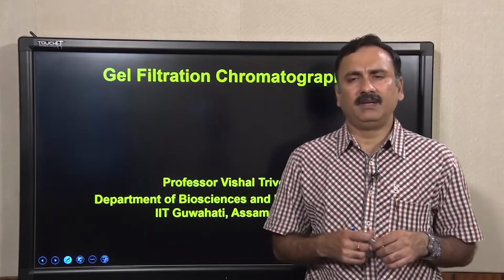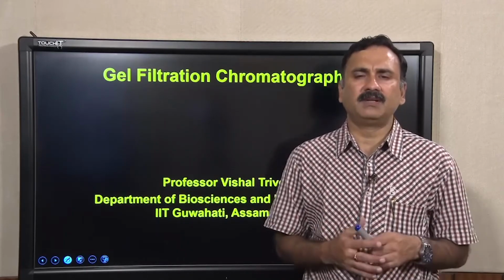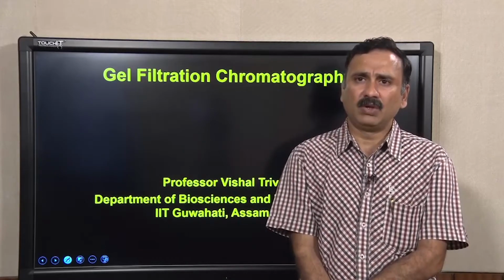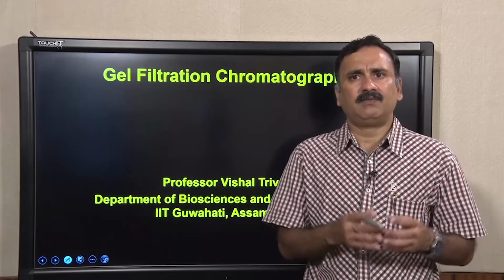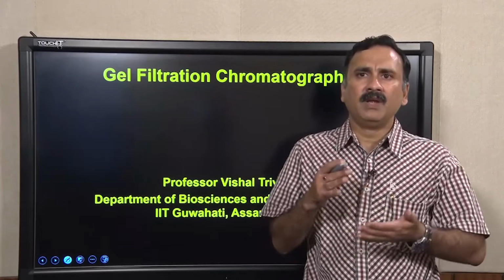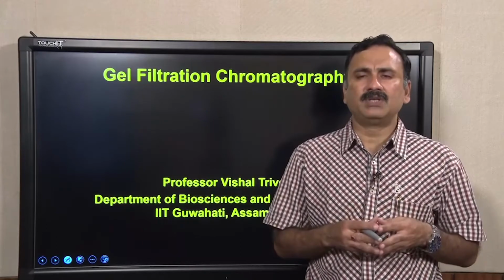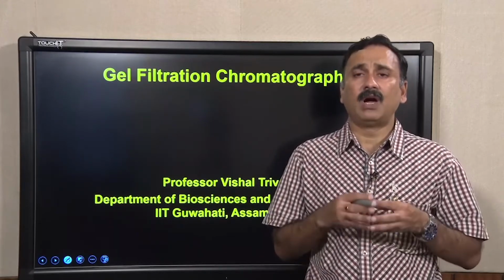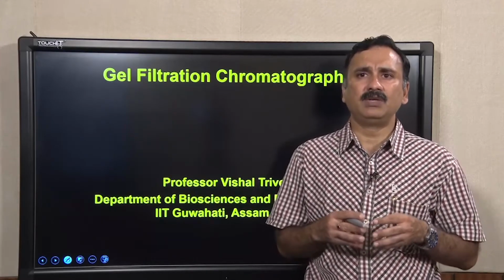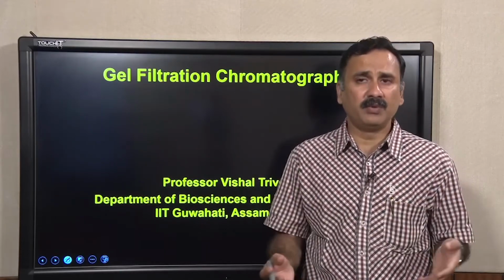And what we were discussing was gel filtration chromatography. In the previous lecture, we discussed the basic principle of gel filtration chromatography, how to pack the columns, and what different aspects you have to consider while running a gel filtration column or maintaining a packed gel filtration column. Now, in today's lecture, we are going to discuss how you can exploit gel filtration chromatography to answer some scientific questions or problems.